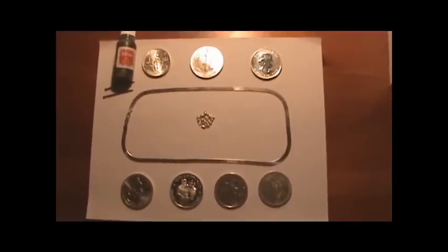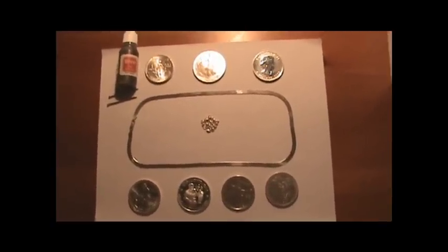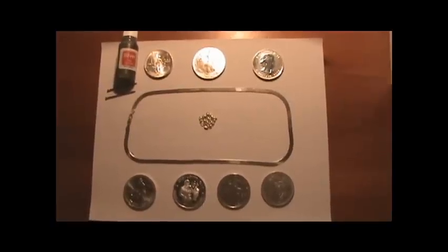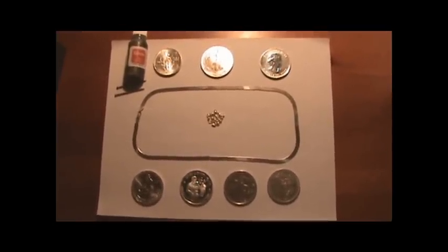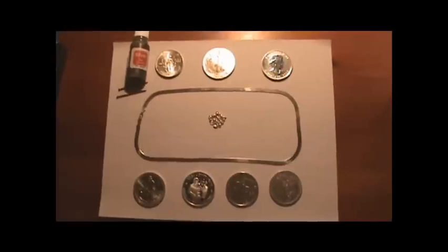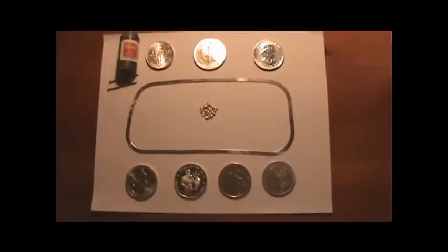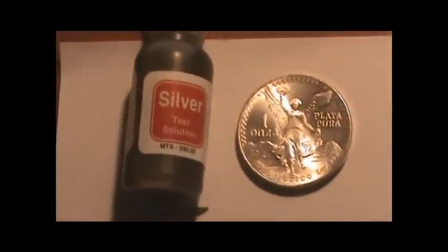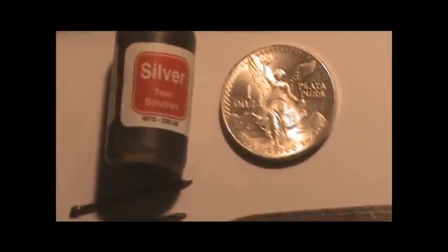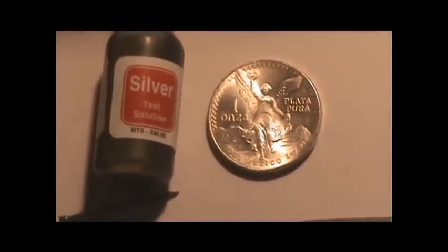As far as silver, the most information I found on the internet refers to just looking for the actual markings — which we all know can be forged. So what I've done here, I have a few coins laid out, a chain, and some silver shots that we'll be testing with the actual acid.